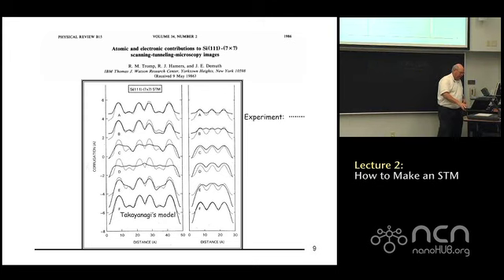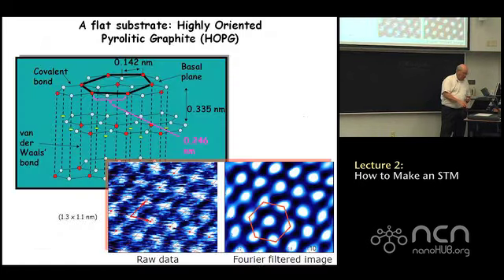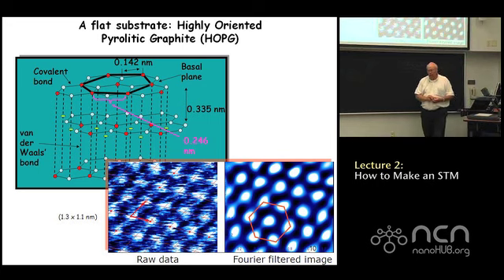It's a major advance. At the time, it was really exciting because most of the people in the business were well aware of how difficult this silicon 111 problem was over time, right? The other thing the scanning tunneling microscope did was it allowed you to image atoms on a reasonably routine basis.